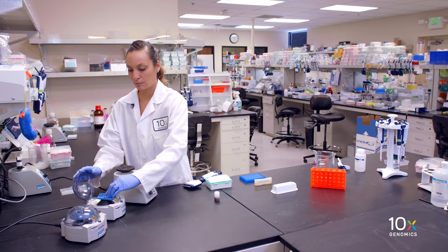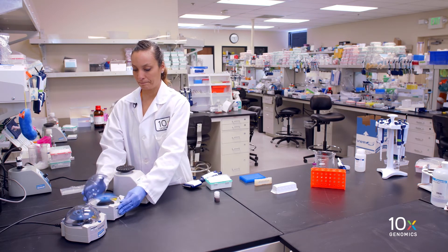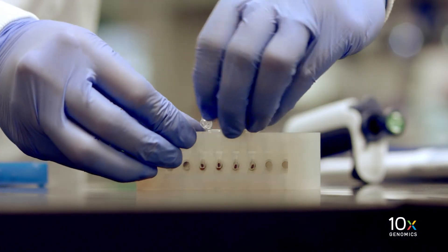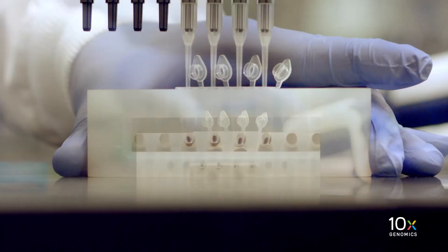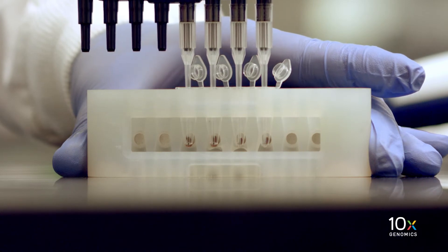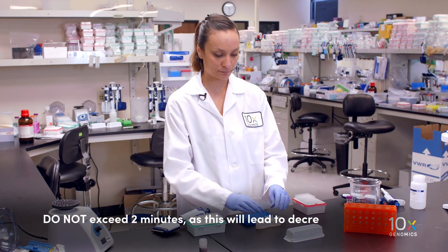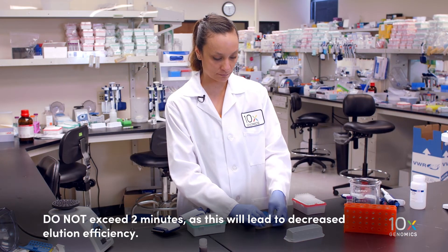After the second ethanol wash, centrifuge the tube strip briefly and return it to a 10x magnetic separator in the low position. Remove and discard any remaining ethanol. After removing the residual ethanol, let the samples air dry for 2 minutes. Do not exceed 2 minutes, as this will lead to decreased elution efficiency.